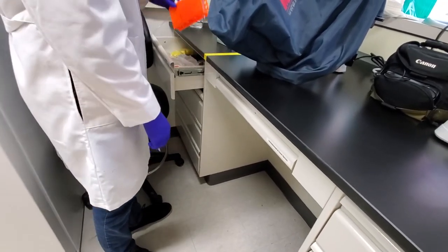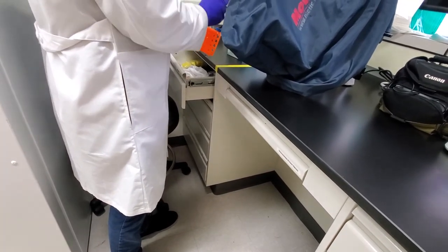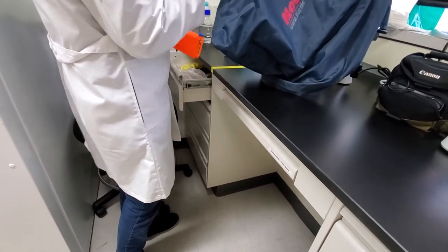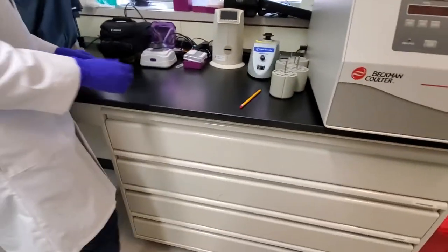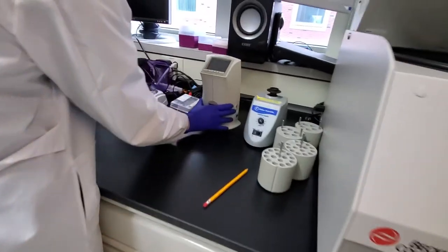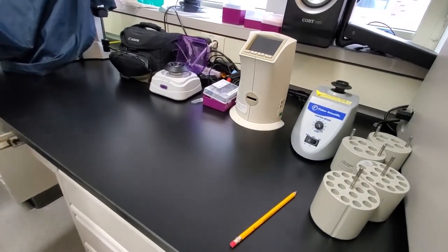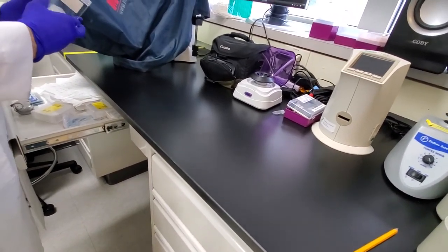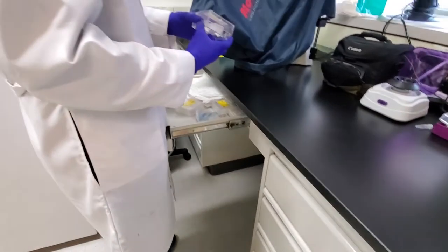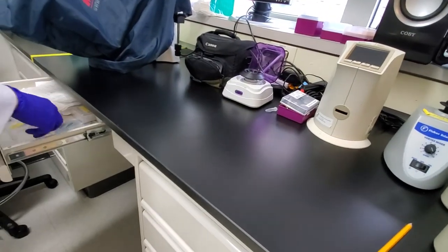We keep trypan blue here, aliquots to go in and out of, and if we need more, then we have this container here. We also have an automatic cell counter, which is actually pretty easy to use, but I'm sort of old school, I like the hemocytometer. But I can show you how to use this sometime if you want. We have these special slides. You just add your cell suspension with trypan blue, put it in here, press a couple buttons, and it gives you a readout.